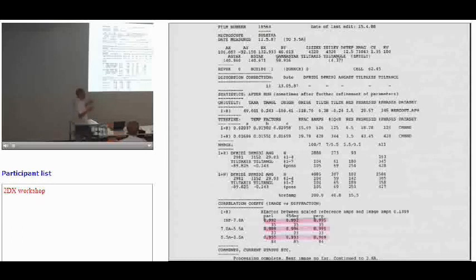It's a very good image. But if it's a weak image or a noisy image, these numbers would be smaller. And if it was rubbish, cross-correlation would be 0, and this would be 7, which would be the same as the background. So it allows you at a glance to see how well you're doing, whether you're making progress or regressing, in which case you should stop and go back to your last good pass. And so you can judge how good your image is, how good your computer processing is, and you immediately have a feel for how well you're doing, and it's reliable.